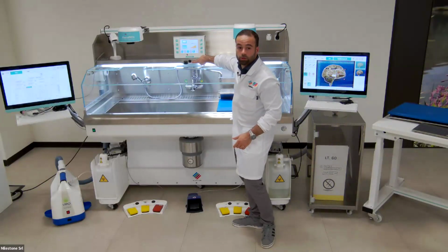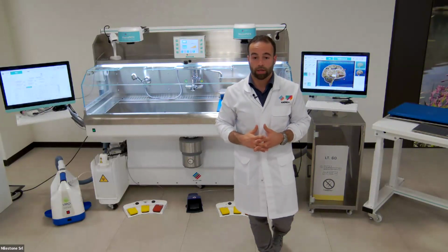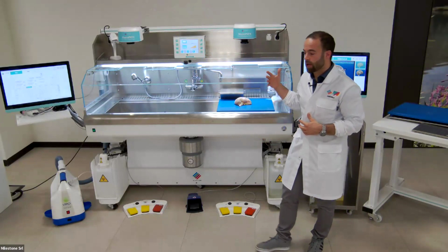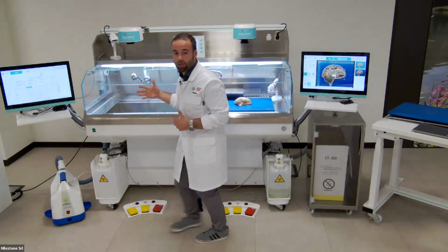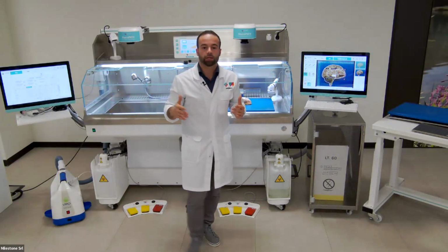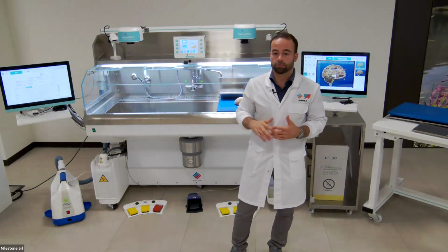This black dot that you see here recognizes the presence of the operator. So once it's turned on and the operator positions himself in front of the grossing station, it starts automatically, performs a check that everything is working well, and then starts the ventilation.